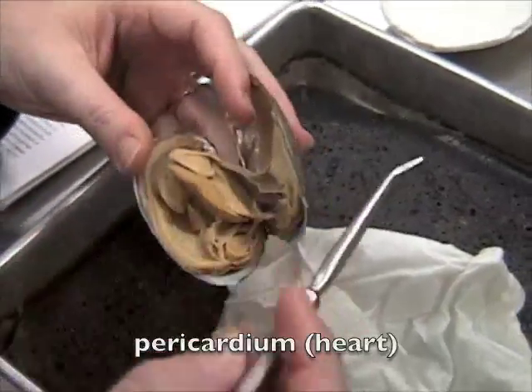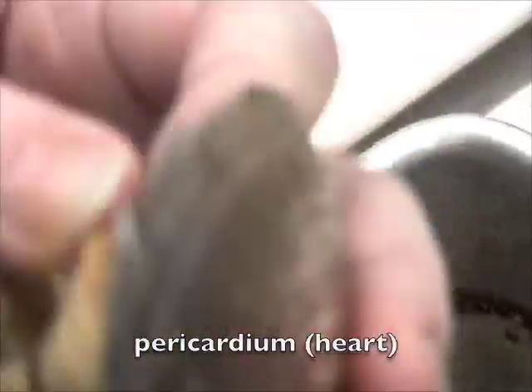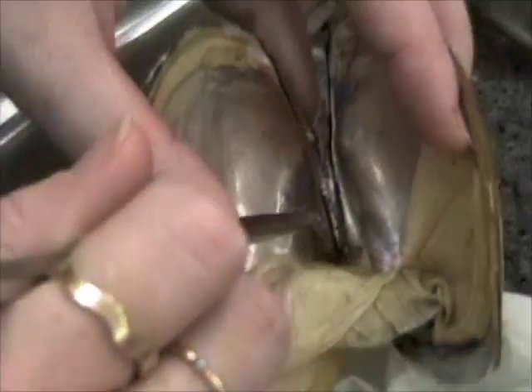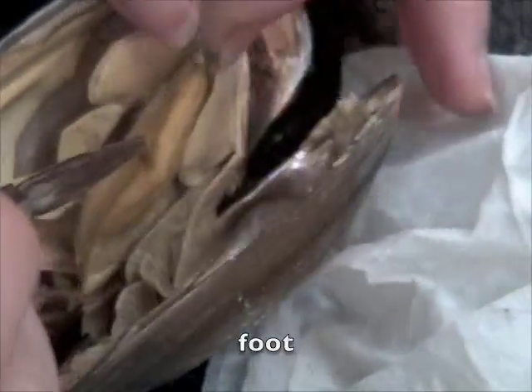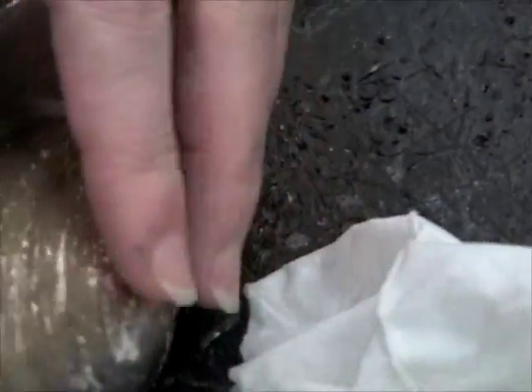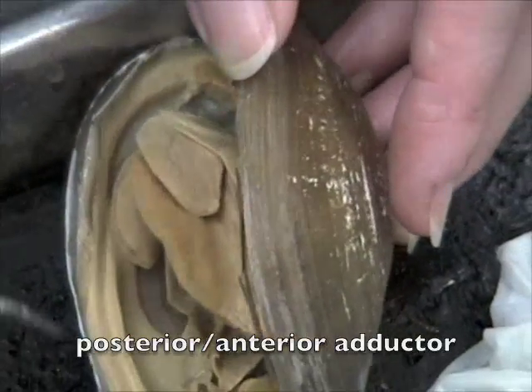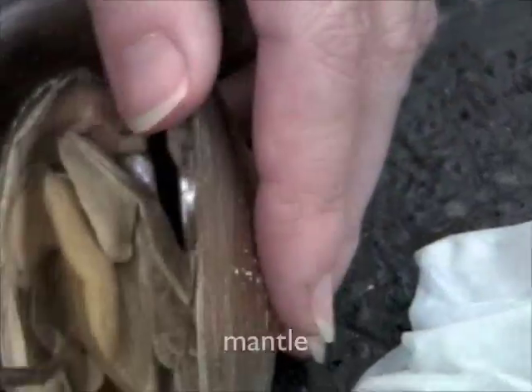The pericardium, or heart, is located directly underneath the hinge. So the pericardium is this area right here. We have the foot right here. This is the posterior and this is the anterior adductor muscle — in relation to the beak, because it's in relation to the beak.